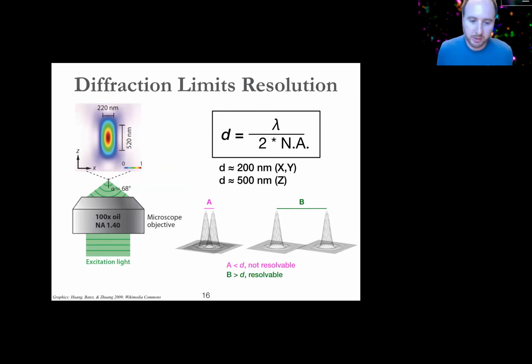So when we talk about super resolution imaging, the problem we're essentially trying to get around is the property of diffraction limiting how small of an object we can resolve with our microscope, no matter how much money we spend trying to make it fancy. So practically, for the wavelengths that we are most likely to image in an in situ hybridization experiment, say, that ends up bounding you on the order of about 200 nanometers or so in the XY or lateral dimension, and 500 nanometers or so in the Z or axial dimension.